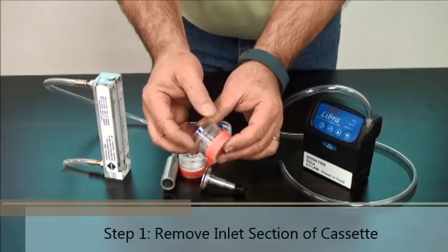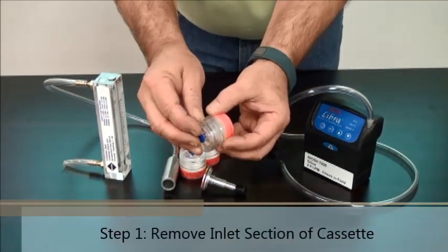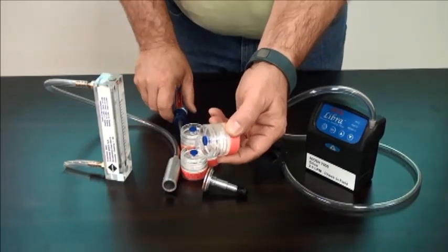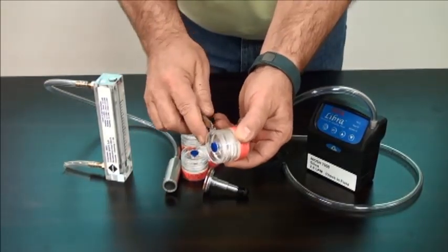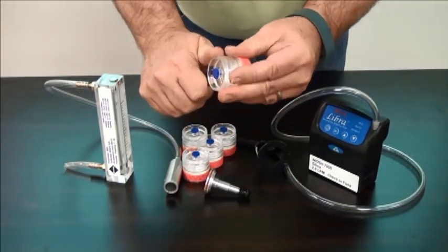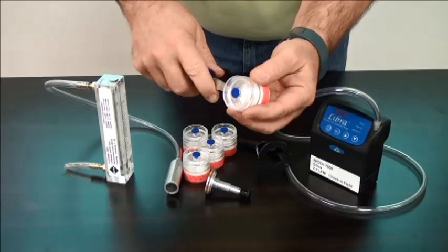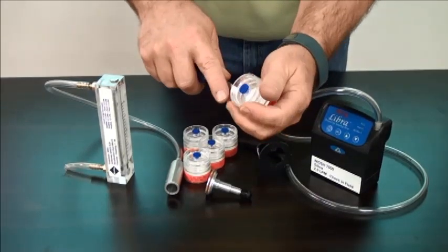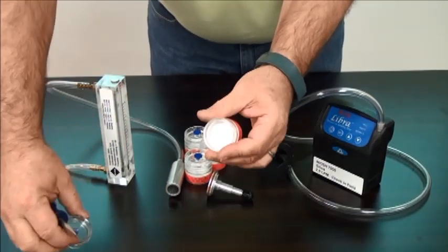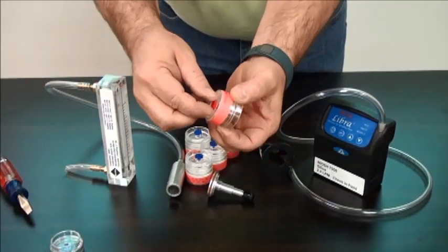Take your 5-micron PVC three-piece cassette. You're going to remove the inlet section of the cassette, so you're going to need to cut this clear plastic band. Pry the inlet section out and put it aside somewhere safe. Remove the outlet plug.